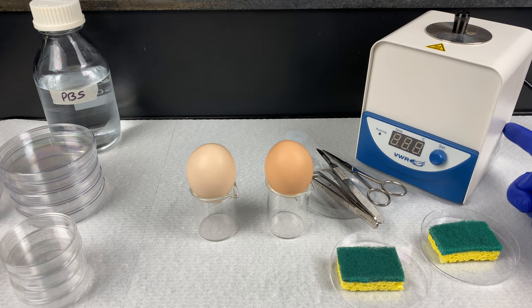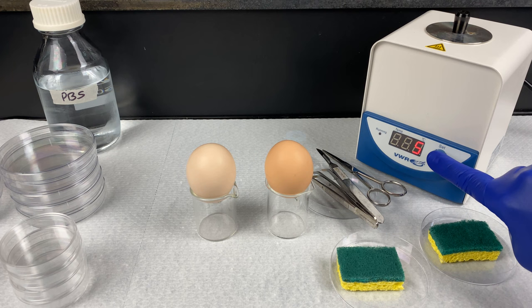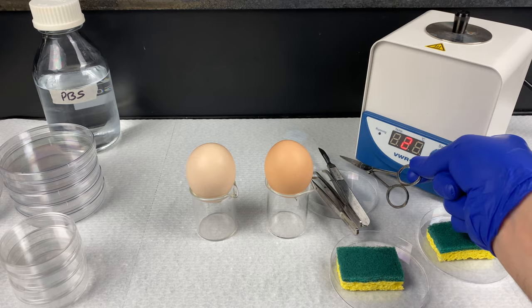Start the lab by turning on your bead sterilizer, or Steri. Glass beads inside this device will heat up to 250 degrees Celsius. To set it, press the set button — it will beep. You should see the light blinking to indicate it is running. If it is not set to 250, rotate the set button until it reads 250 degrees Celsius, then press it again and it will start up.